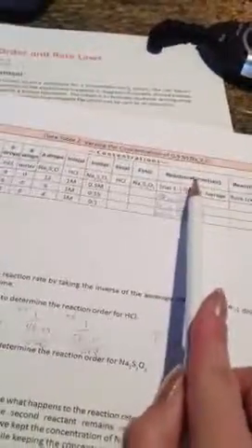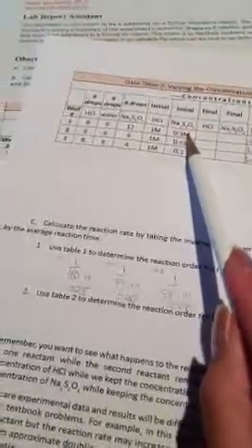Whereas my concentration for my sodium thiosulfate, as the initial concentration changes, my time almost doubles every time. So I would say that's probably the first rate order, from 1 to 1, and if you wanted to do the 0.3 moles to 0.1, my timing almost quadruples there, which would be the second rate law. So yeah, that's what I would say about rate law. That's how I found my rate law for this experiment.